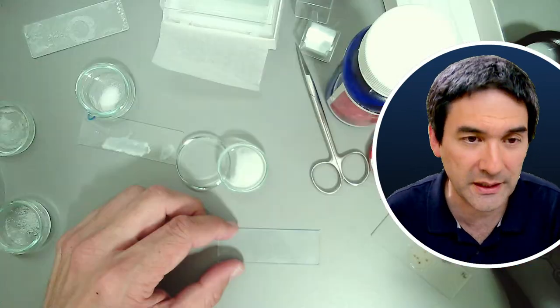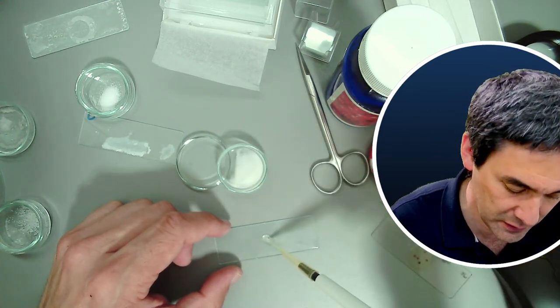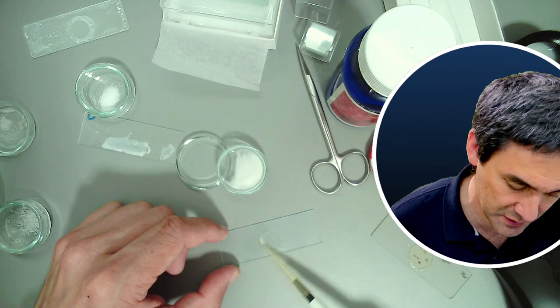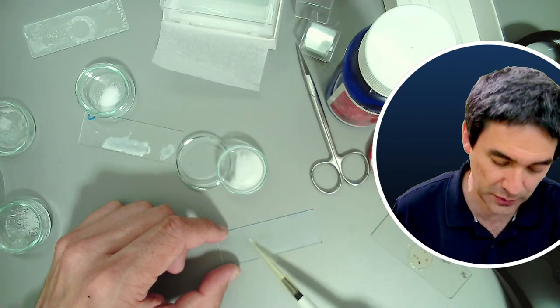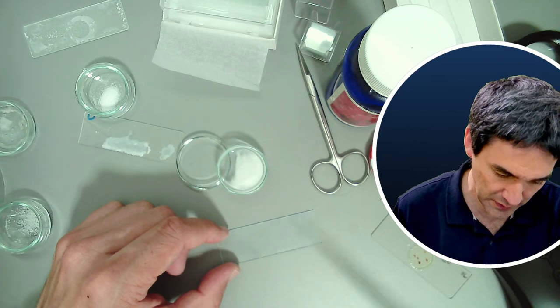So let's try it again. Where is this? Here we go. I'm going to take again some liquid here from the top. I'll use two drops. What's going to happen is it's going to start spreading, or I'm going to just spread it a little bit myself. Okay, and then let's see what happens.